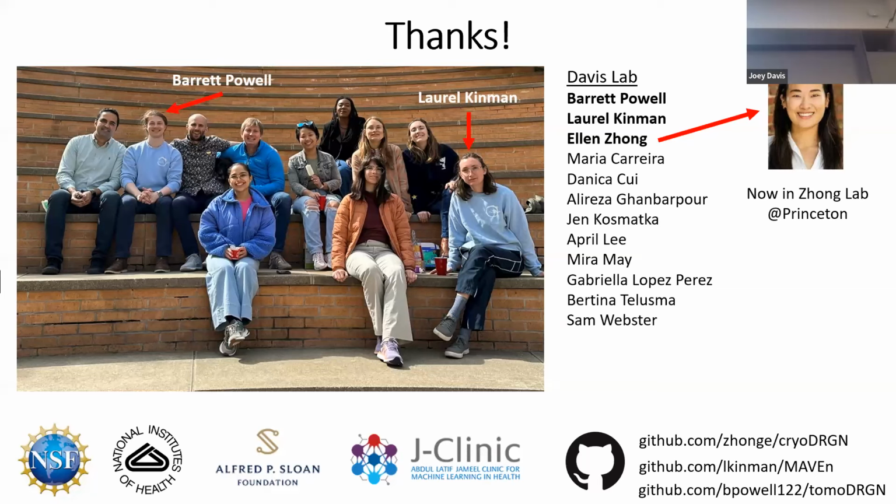Yeah, so there's two approaches, there's three approaches. The first approach is that you simulate data and you have ground truth labels. That's great because you have ground truth labels. The problem is that the simulations are never right. They don't capture the noise model properly. There are all these imaging artifacts that come through in real data. We have built things that work great on simulated data and not on real data. We've also built things that are bad on simulated data that work great on real data. So there are a lot of reasons that I don't love simulated data.